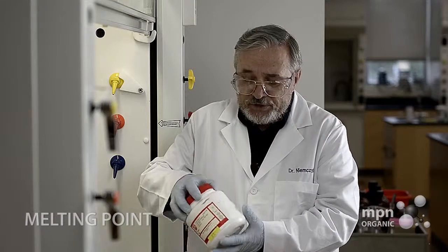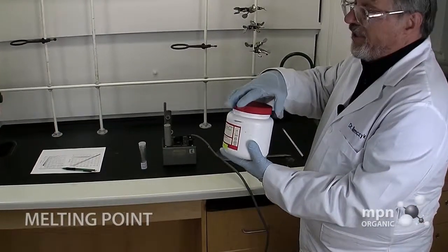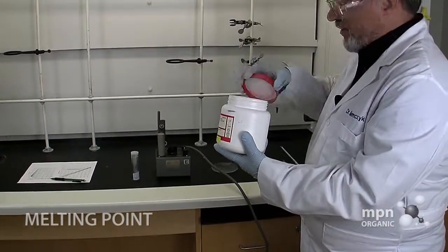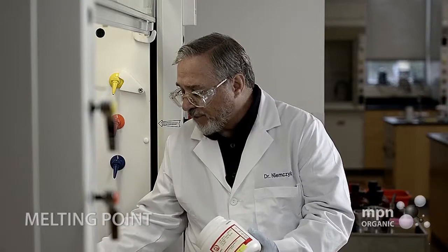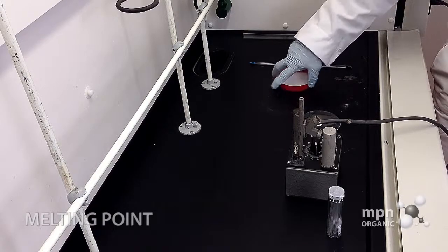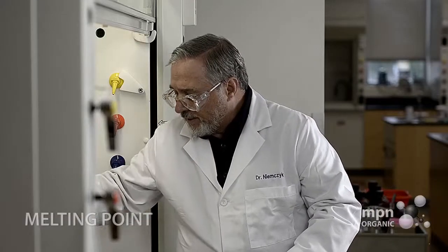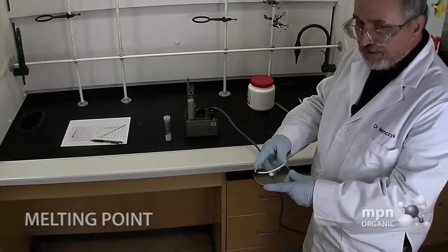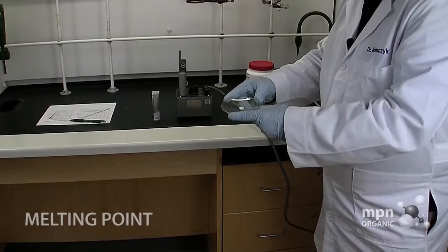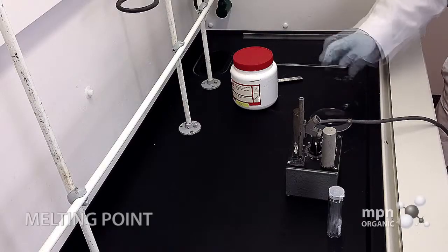For this demonstration I'm going to use trans-cinnamic acid, which comes in a large container like this. We're certainly not going to use all of this, but we're going to take a little bit and put it on a watch glass. I like trans-cinnamic acid because it's nice and dry, it's nice and crystalline, and it's within the range of our equipment. We've got this much on a watch glass — that would suffice for 25 melting points at the amounts that we use.